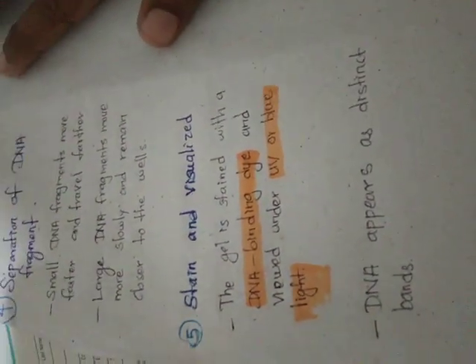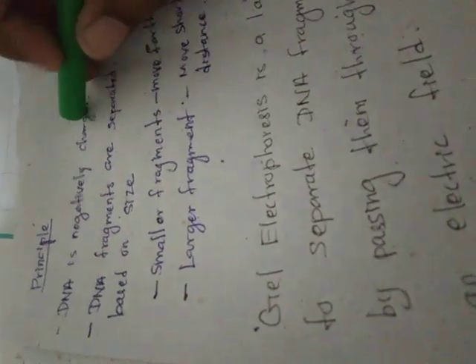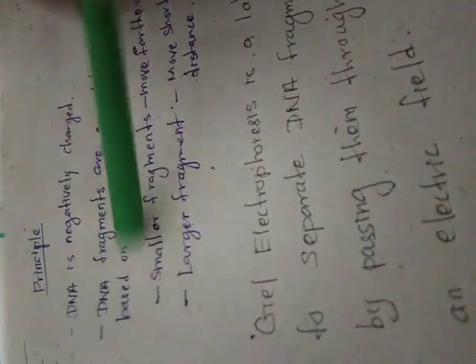So this is gel electrophoresis. Finally, we have the principle of gel electrophoresis. What is the principle? DNA has a negative charge. If it has a negative charge, it moves towards the positive charge. DNA fragments are separated based on size. Do you know which step this is? The fourth step, separation. Smaller fragments move farther, and large fragments move a shorter distance.